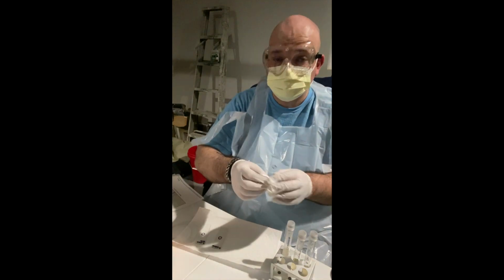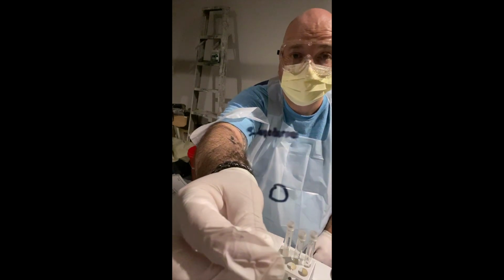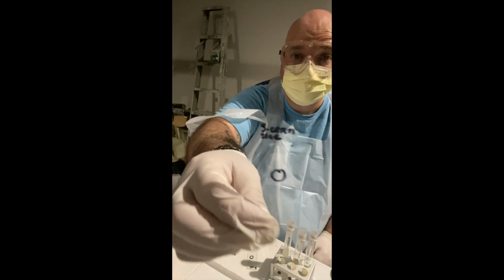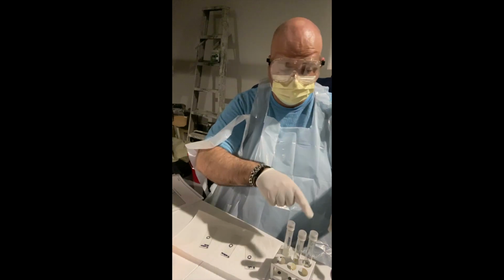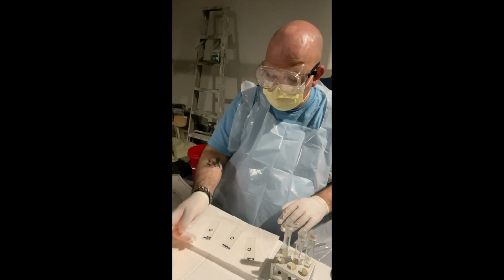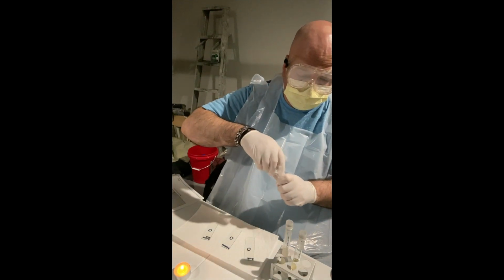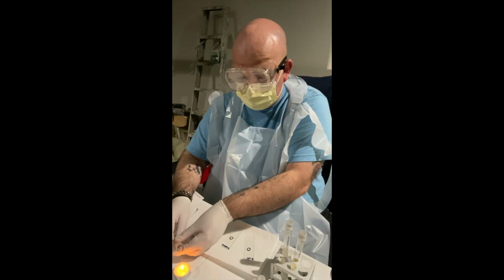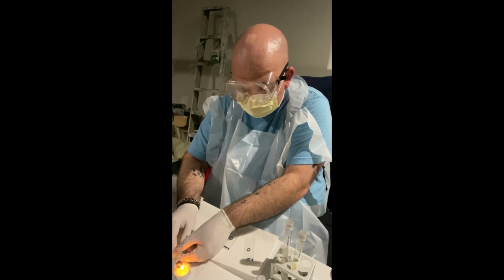Okay, so I now have my 3 slides, E. coli, S. epidermidis, and S. cerevisiae. The procedure for transferring these specimens for each microbe or bacteria to the slide is going to be identical. So the first thing I'm going to do, starting with E. coli, is remove the lid from the tube. And then I'm going to flame the tube here, just to sterilize it. Make sure there's nothing living on it so I get a nice clean sample.